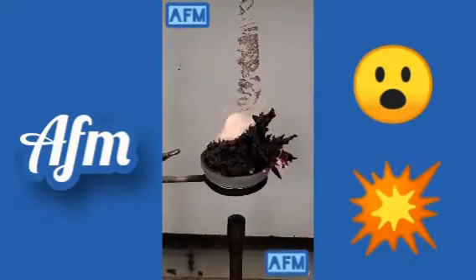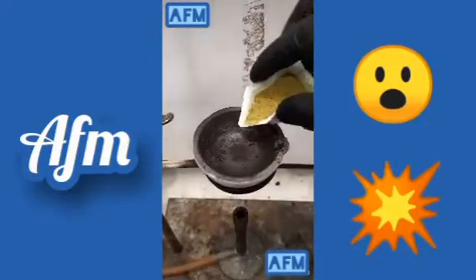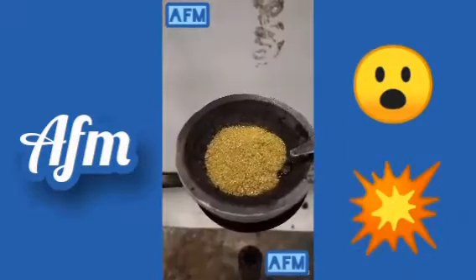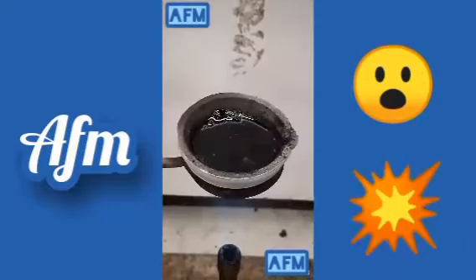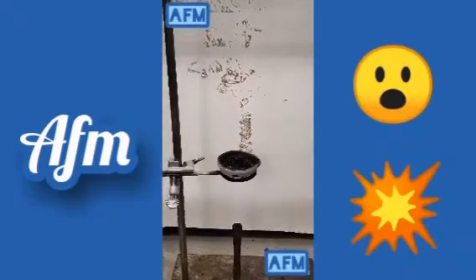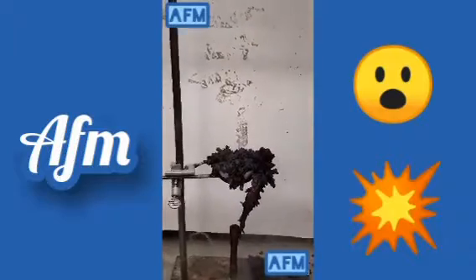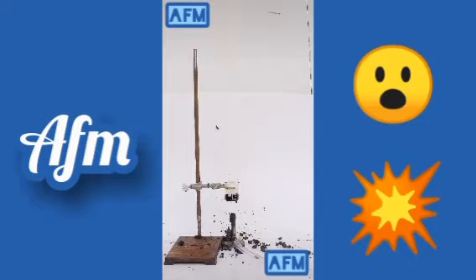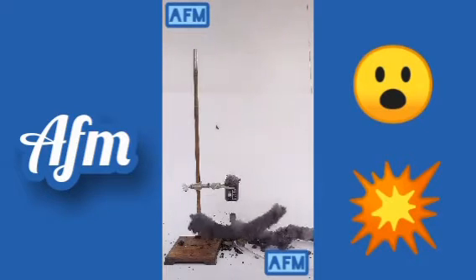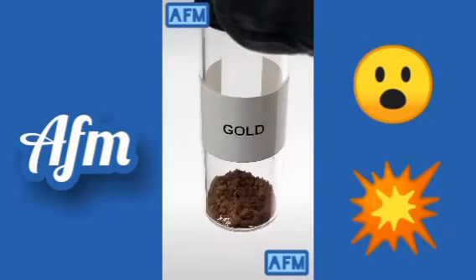It's supposed to make a big snake thing, but this is just kind of sad. I'm gonna try to do it again on a larger scale and see if it works better. It was kind of the same thing, but bigger. The last time that I did this, I did it in a beaker, and it seemed to work a lot better than this dish.